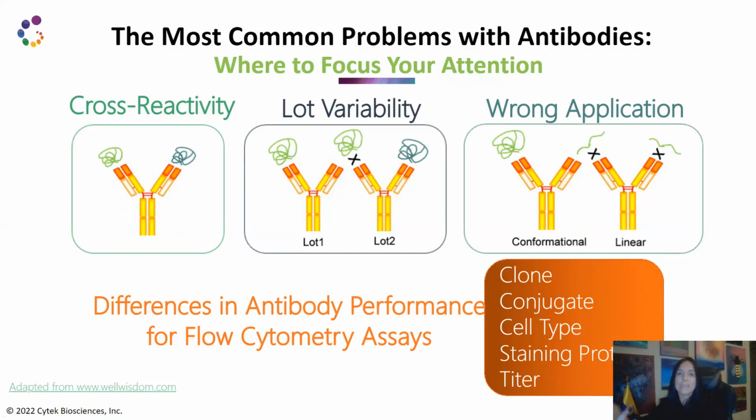Staining protocol, because anything in the staining protocol could affect that binding capacity, things like temperature, incubation times, washes, all the buffers that could affect the binding, but also the levels of expression, and definitely titration, and that's why it's the center of this presentation.